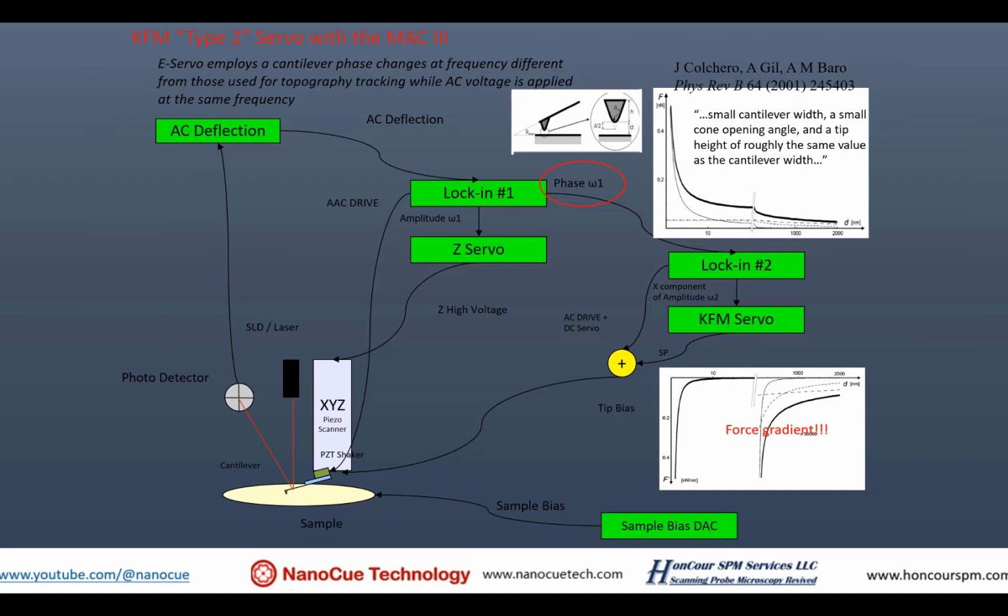That part is fairly robust, and you can do it either digitally or in mixed analog, like we did at Agilent. Right now our present design uses full digital controls for doing a similar heterodyne scheme. We're operating at much higher frequencies.